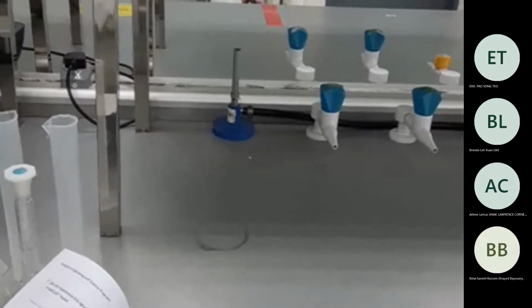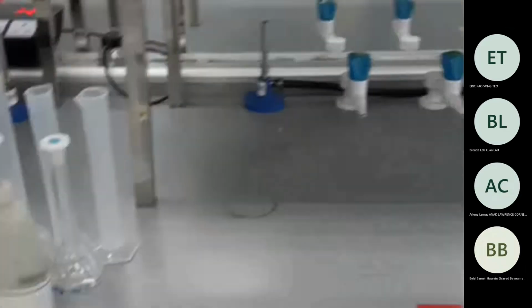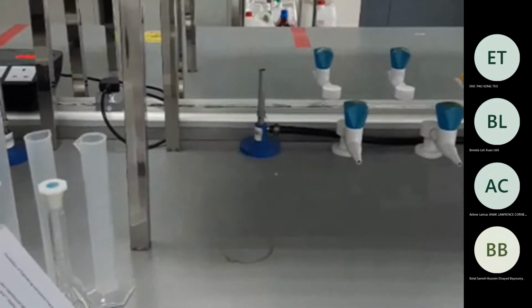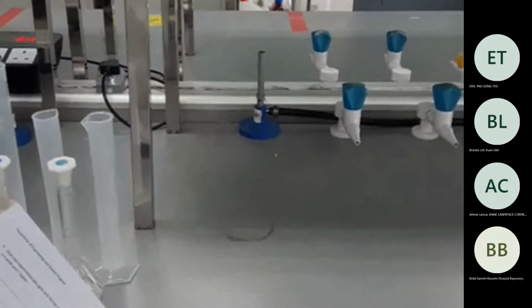We have to find out the concentration after some time. The initial concentration, how do you find the initial concentration? It is given, right? 0.1 or 0.2, whatever is given there, 0.1 molar or 1 molar. And then after some time, we detect the pH. We find the equilibrium concentration, and that will be used for the equilibrium concentration. So the changes we can find out from the calculation that we have done before, right? This type of ICE table, we have done before in the tutorial in the lab.